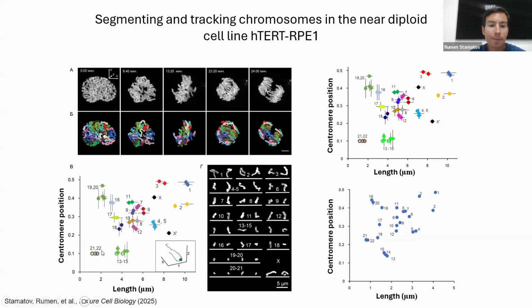it against the length. And now this 2D plot gives us complete information about the shape of the chromosomes relative to the karyotype, because each chromosome has a known length and centromere location. In this way, we can uniquely identify most of the chromosomes, except for those which are very similar. For example, 4 and 5 are very similar in shape, so we can't really tell them apart.